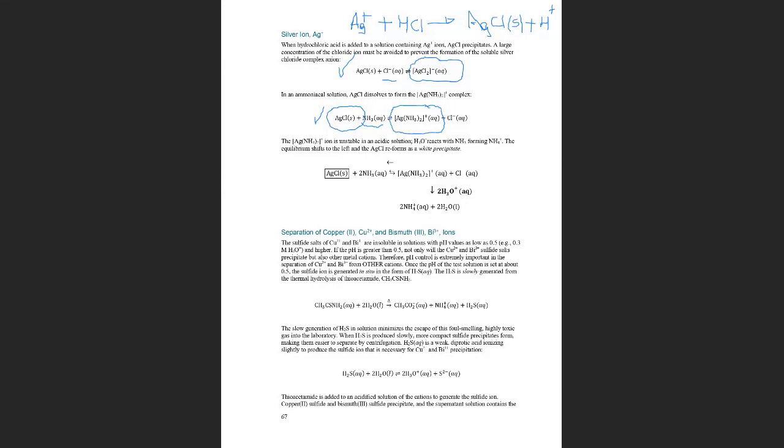Yvonne, any questions? Yeah. So I got the white precipitate. I'm kind of confused, so the second reaction is checking what? Okay. So sometimes one reaction is not enough because you can have 2 different cations that give you a white precipitate. So usually in chemistry, you want to confirm. The second reaction is a confirmatory reaction. So first, you obtain the white precipitate, and then you add ammonia.